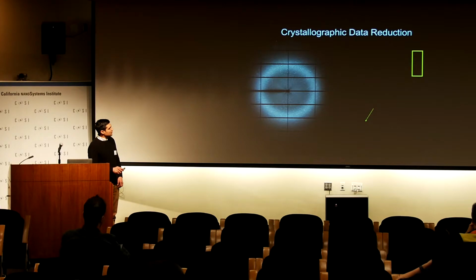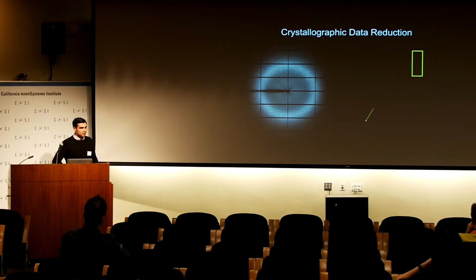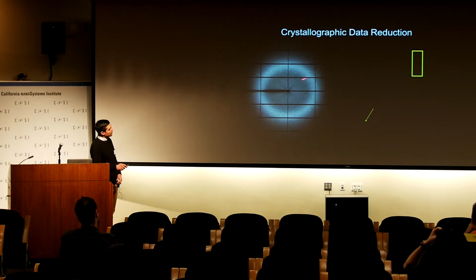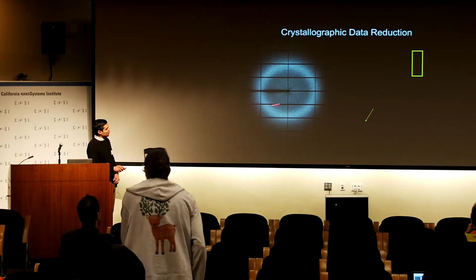And I'll start by saying, the concept of data reduction for X-ray crystallography is best summarized by looking at a picture of something like this. This is produced when a beam of X-rays is hitting your sample. Your sample is a crystal, and it produces an interference pattern, and that's what you're recording. This interference pattern produces a number of peaks that you see here. You see them arrayed across this detector, and then almost nothing or some background information around the peaks.